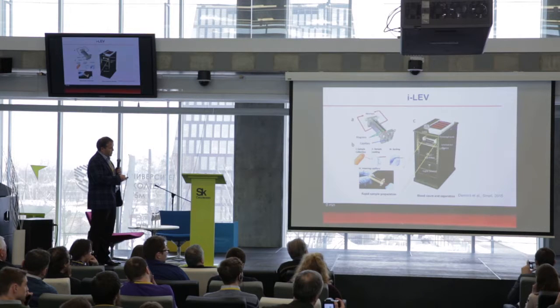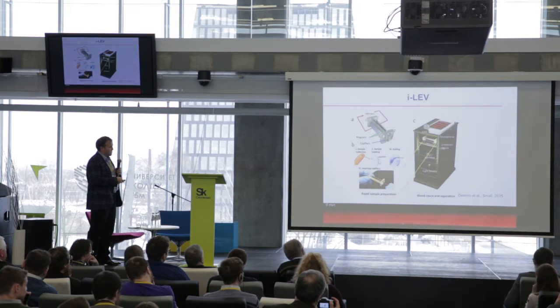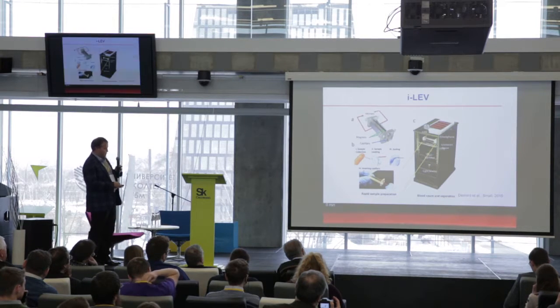And we built this system. It is actually two magnets with a mirror on the side. The capillary goes in. This costs about $1 to make. You just put the blood in the capillary with the solution and put it here. We make it much larger to be able to do fluorescent imaging as well, but normally the system is very small, like a little tower. And then this is what happens.